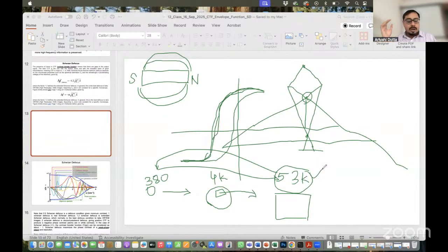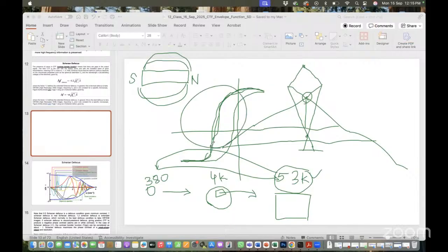Whenever we are considering that we want a very perfect image, very high resolution, 2 angstrom or 3 angstrom, it is going to be affected by this lens hysteresis, because we are not following the protocol. Whatever magnetic field we are considering for the defocus or the magnification is not exactly the same value. It is changing because of this lens hysteresis. Is it clear?